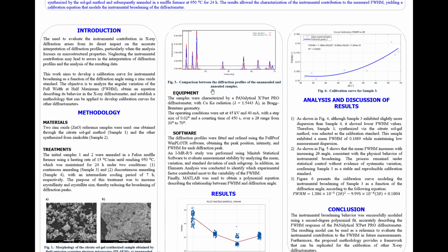Finally, we obtained a polynomial equation describing the relationship between FWHM and diffraction angle and plotted the calibration curve for sample 3.